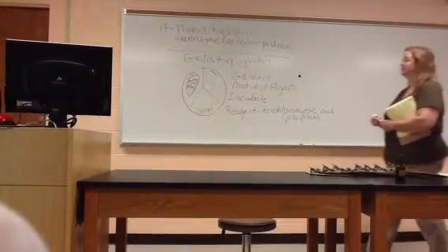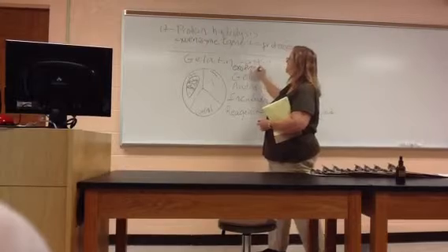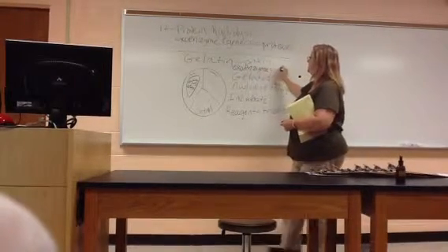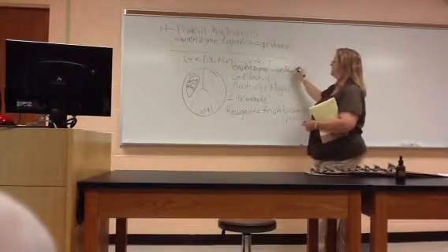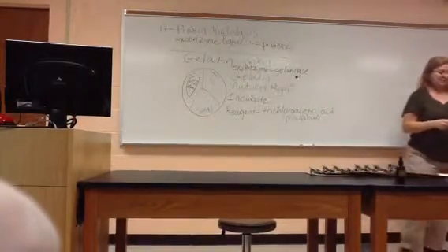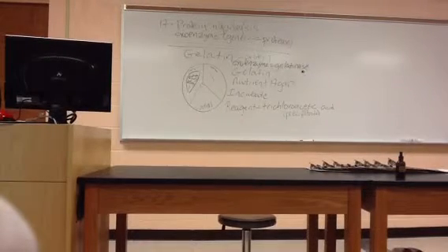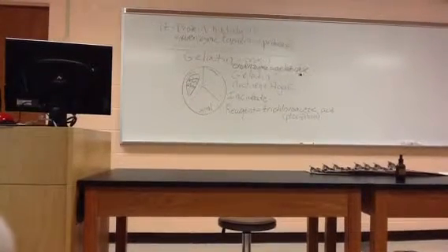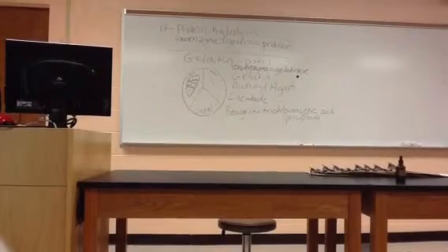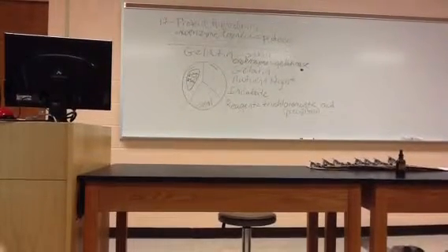What did you say the exoenzyme was? I didn't give you the name yet. Oh, that's a good question. Let's do that. The exoenzyme is gelatinase. It's specific for gelatin, right? Gelatinase is the exoenzyme that breaks down gelatin. It doesn't break down any other proteins. So positive result again, no white color around the bacterial growth. And that means the bacteria produce gelatinase.